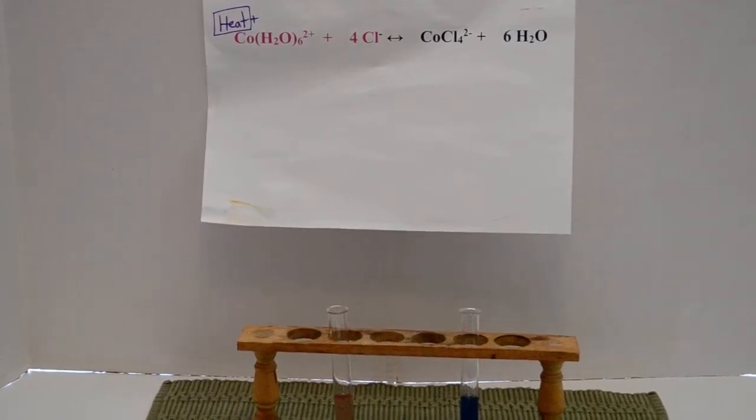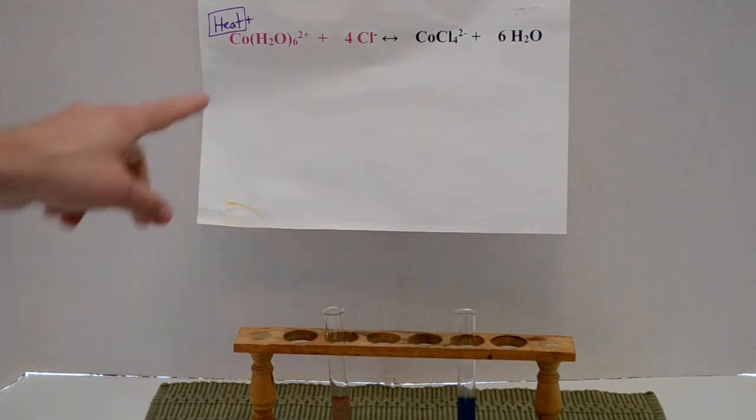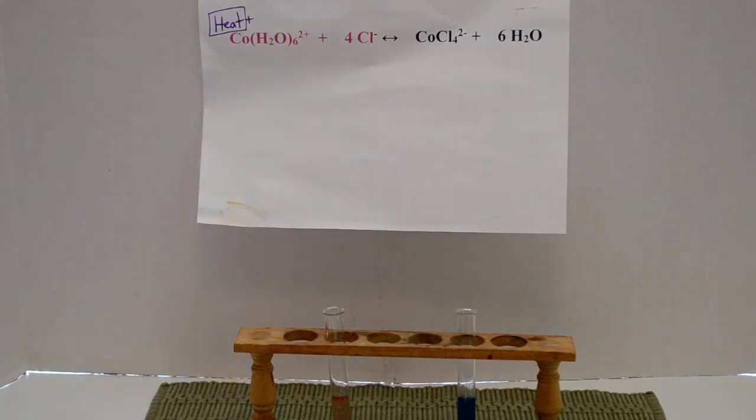Okay guys, so today we're going to do a lab dealing with the Le Chatelier principle. And this would be the principle that deals with when we add a stress to an equilibrium. So let's check out this reaction here. I know it's kind of hard to see right now. This is the best I got.